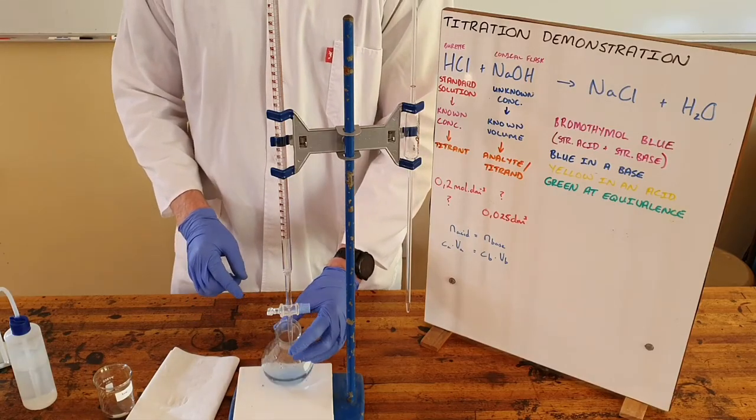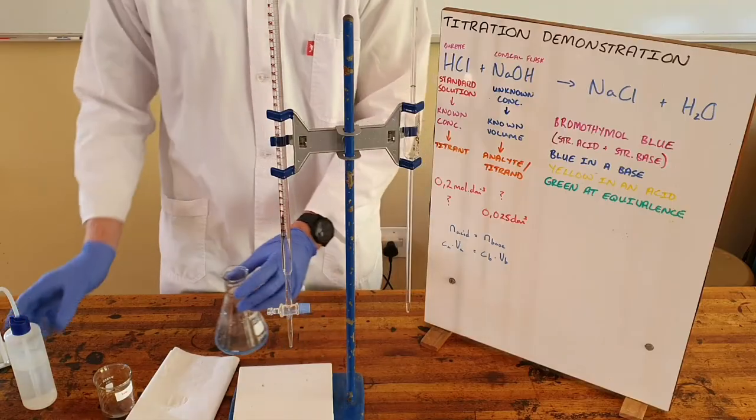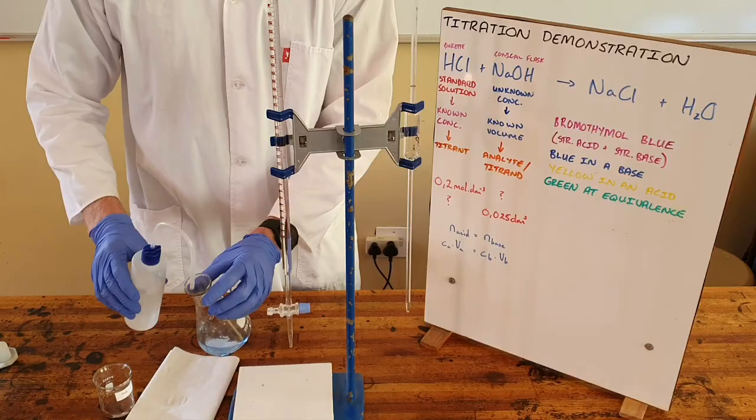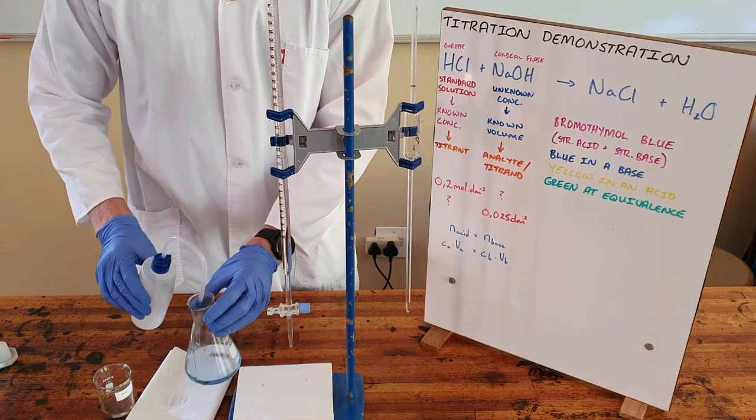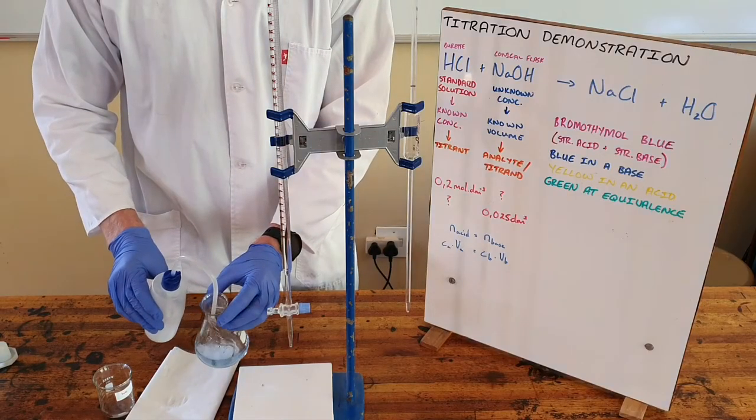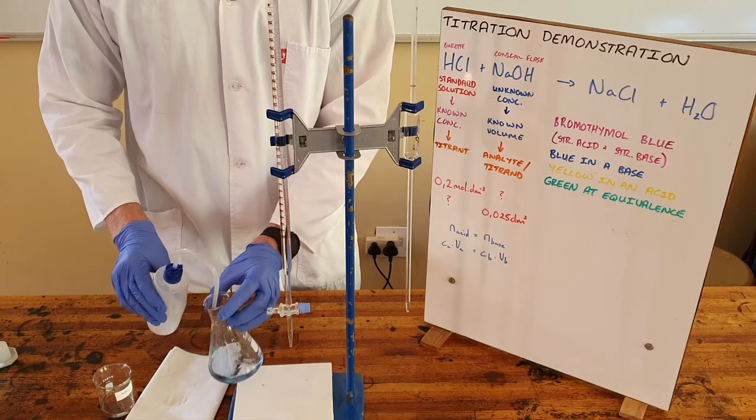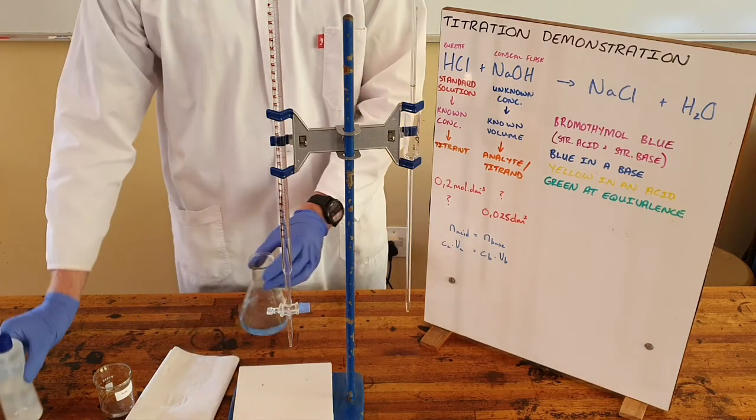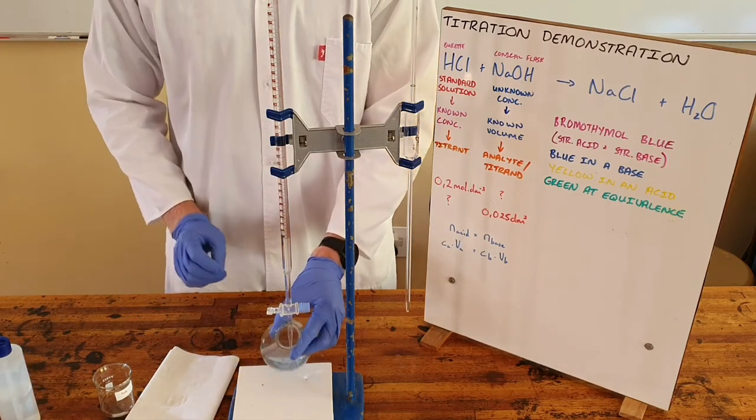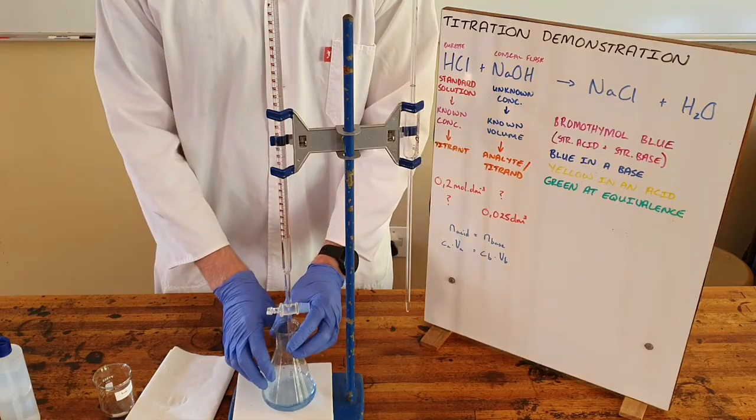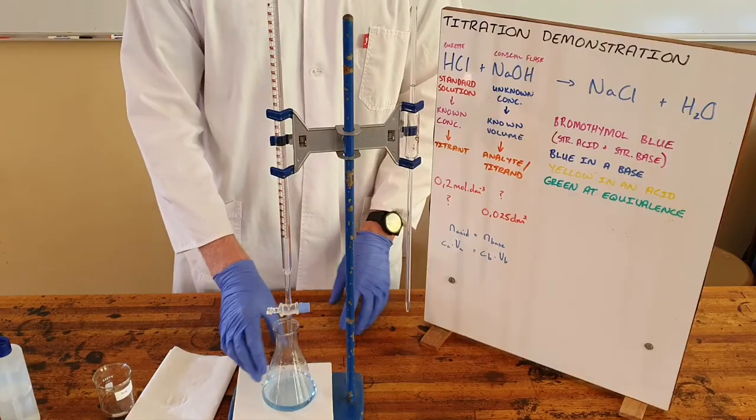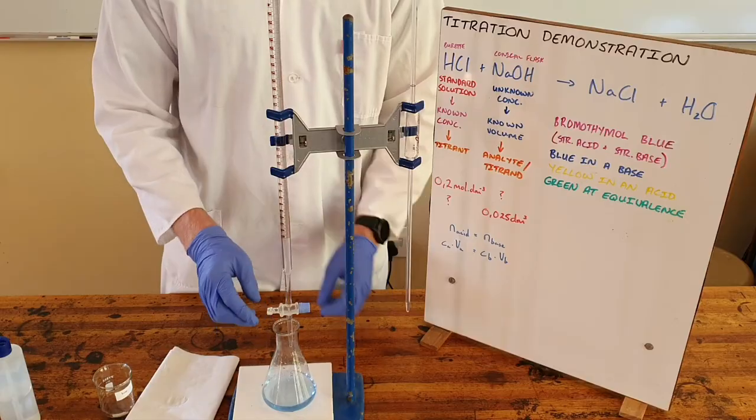What is also necessary is to ensure that there is no acid or base trapped on the side of this conical flask. So I would flush it out with water. Once again this is allowed because the water is not changing the amount of acid or base that is present it is only making sure that it is at the bottom of this conical flask.